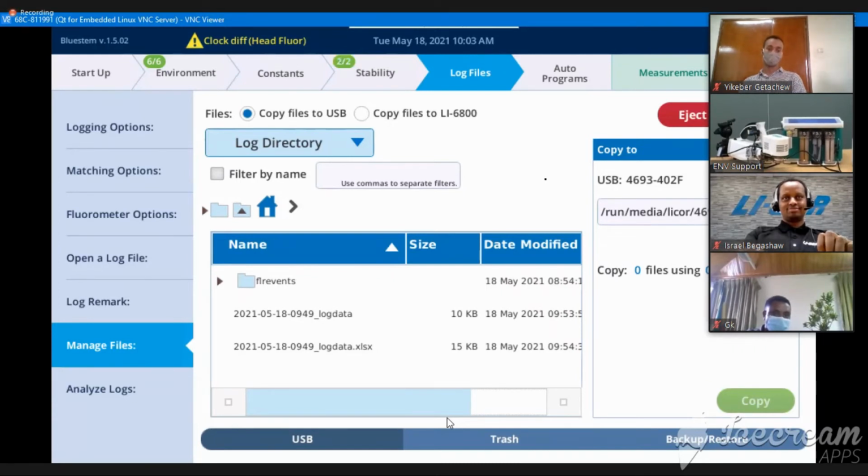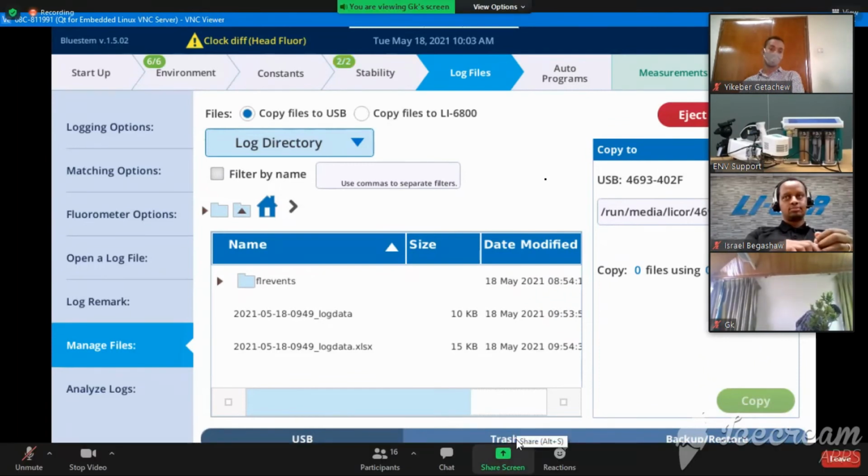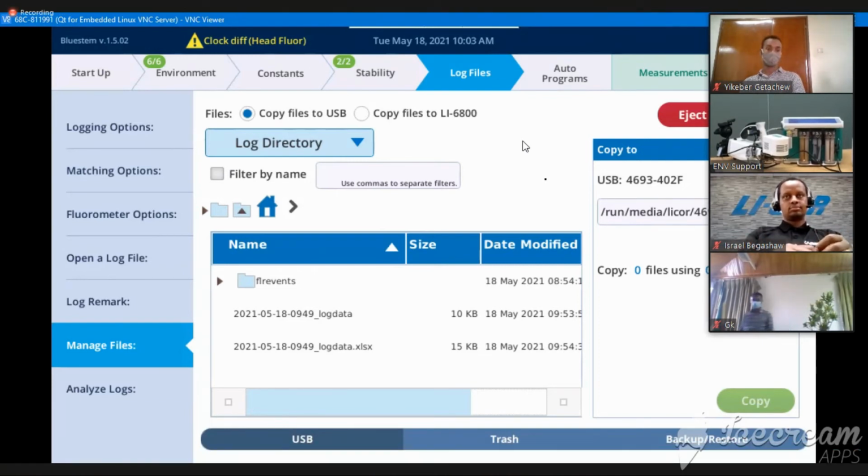You have homework. So what we're going to ask you to do is make some survey measurements. And you can see that this is slide 26 of 27, which means that there's a lot of stuff before it, and we will talk about the theory tomorrow. But we want you to have some time taking some measurements on some plants. It's been a lot of staring at the computer and staring at the instrument. So let's actually take some measurements on some plants.